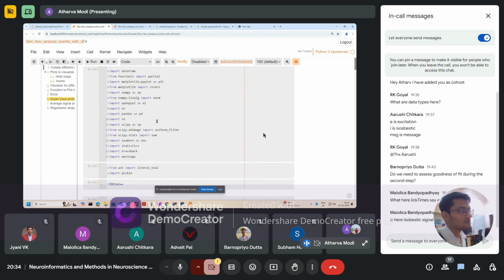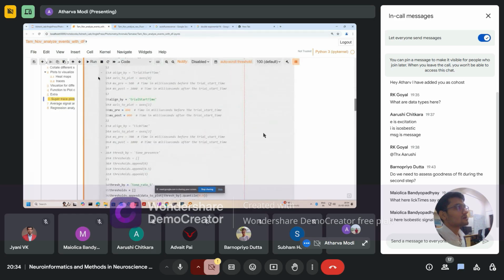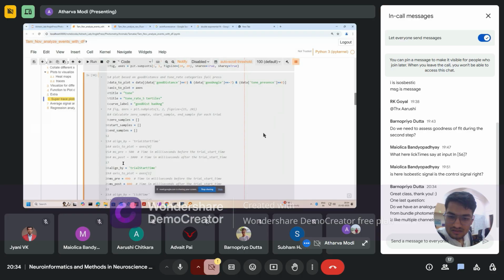And this will help you in building this. So this is a custom built pipeline. These same steps are available in different libraries. You don't need to go through the math of each one, just apply one library, give it the data, and it will give you the final output. But it should not be a black box for you. That's why I suggest that you build your own notebooks, to start. So yeah, that's it.